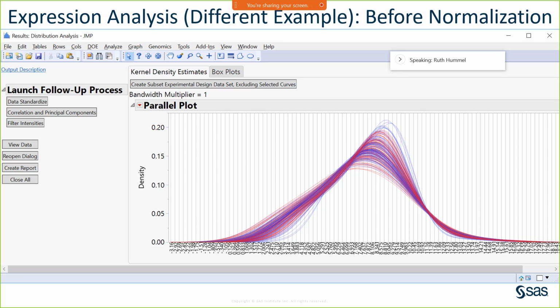We can also start making up some ideas of how we could normalize these. We want to normalize these data because we expect differential fluorescence between different microarrays. There are lots of reasons for expression to be read differently between different samples. When we decide to normalize, we're saying that probably some things will be overexpressed in some samples and some things underexpressed, but overall the general distribution is that everybody has approximately a similar amount of expression, with a similar amount of overexpressed and underexpressed.